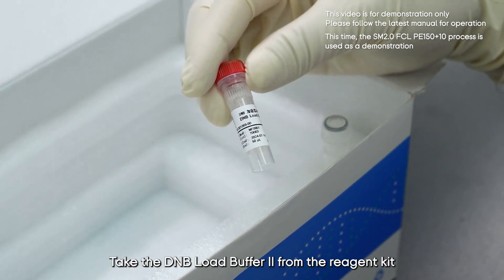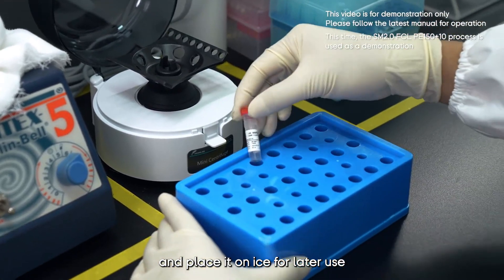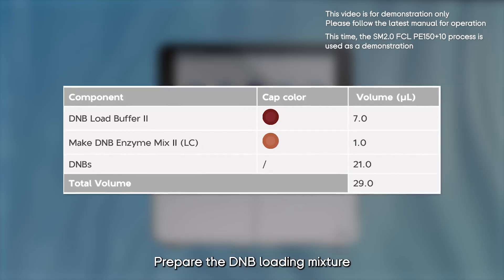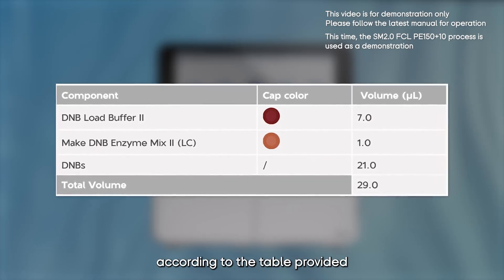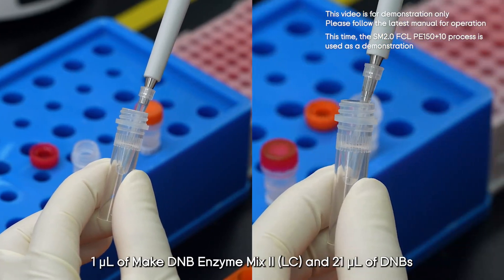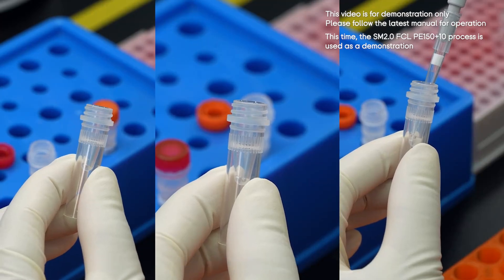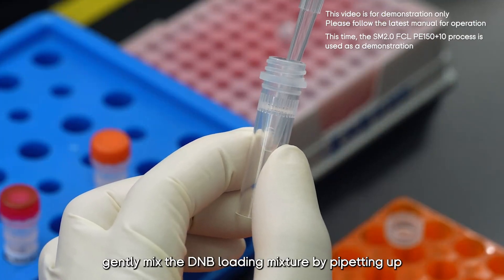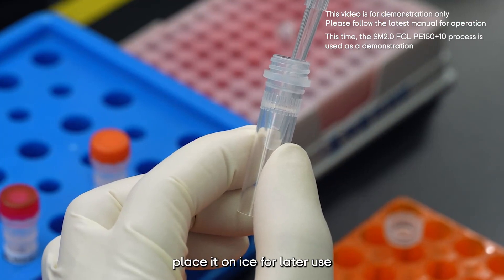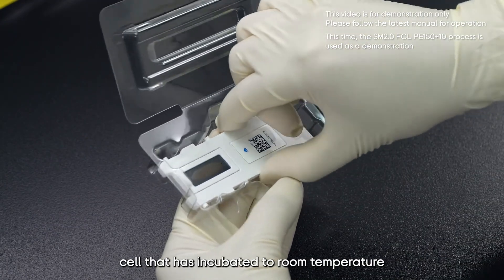During the priming period, prepare the DNB loading mixture. Take DNB Load Buffer 2 from the reagent kit, thaw it, vortex to mix, centrifuge briefly, and place on ice. In a 0.5 milliliter microcentrifuge tube, sequentially add: 7 microliter of DNB Load Buffer 2, 1 microliter of Make DNB Enzyme Mix 2 LC, and 21 microliter of DNBs. Using a wide bore pipette tip, gently mix by pipetting up and down 5–8 times, then place on ice for later use.